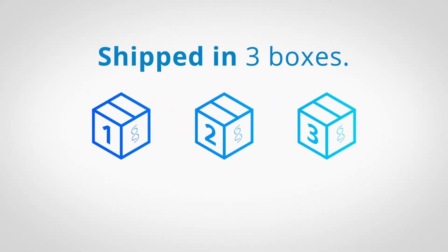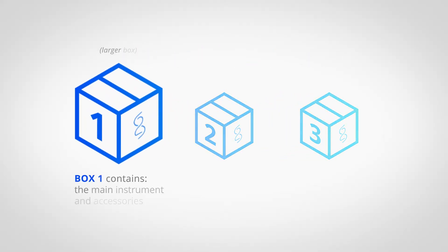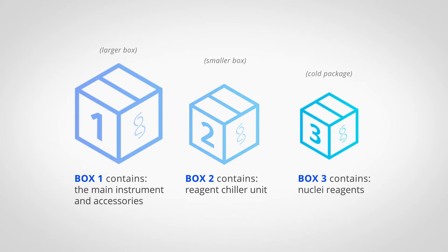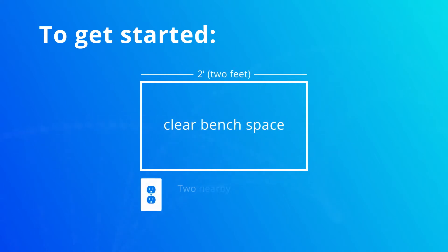The Singulator is shipped in three boxes. The larger box, number one, contains the main instrument and accessories, while the smaller box, number two, includes the reagent chiller unit. Box number three is a cold package that contains the nuclei reagents. You'll want around two feet of clear bench space and two electrical outlets available to install the system.